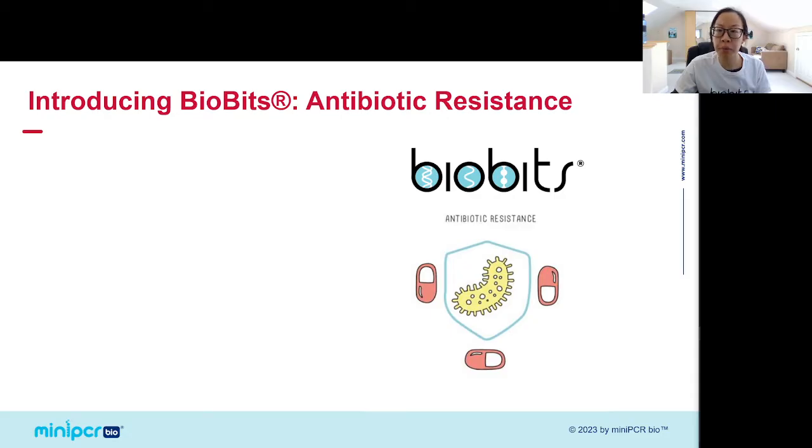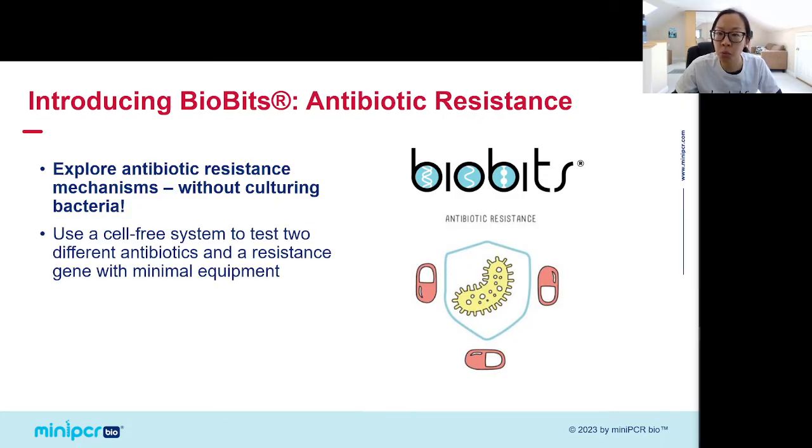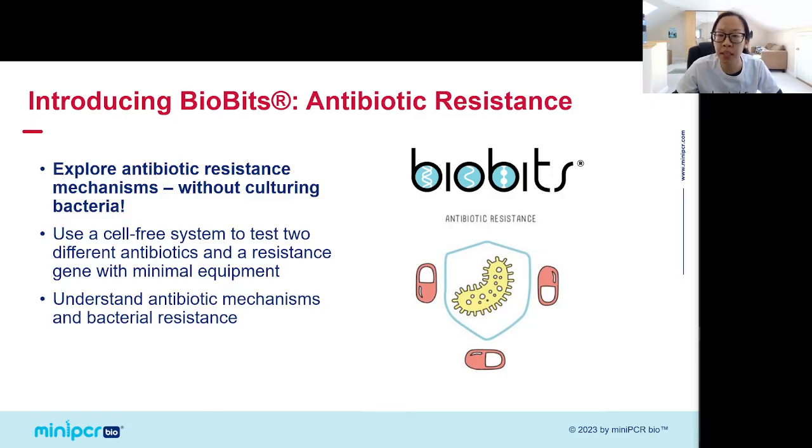All right, so your students will be able to explore these key takeaways that I just talked about, antibiotics and antibiotic resistance, with our new BioBits Antibiotic Resistance Lab. This is an authentic, hands-on lab that demonstrates these different mechanisms without having to culture any cells. Briefly, your students will test 2 different antibiotics and 1 resistance gene using our BioBits cell-free system that requires very little equipment. And after doing the lab, they hopefully will understand the mechanisms of antibiotics and antibiotic resistance and how they work and how specific they are.